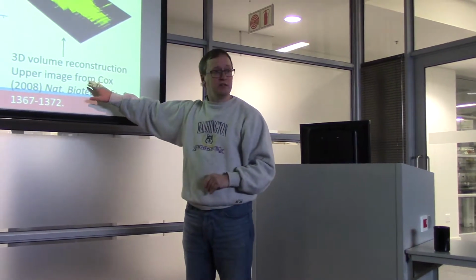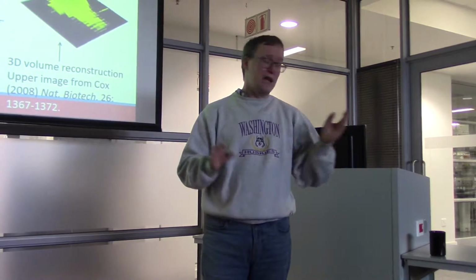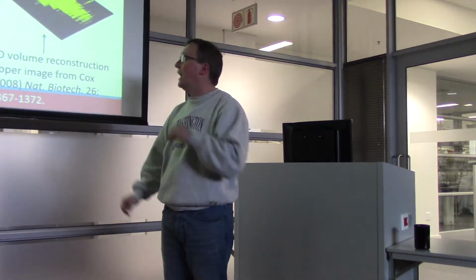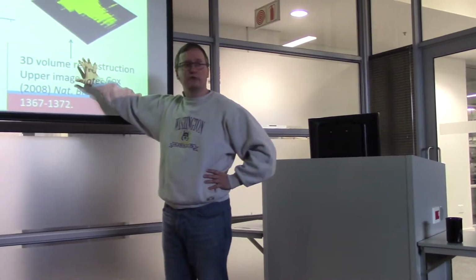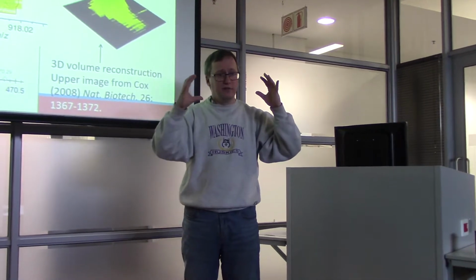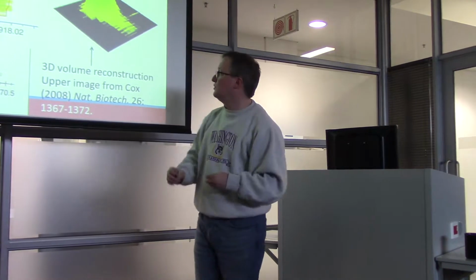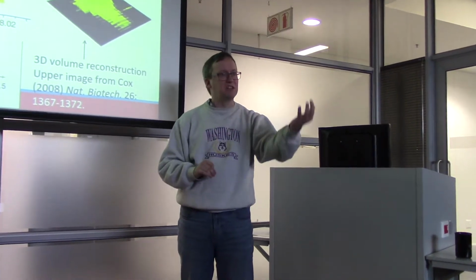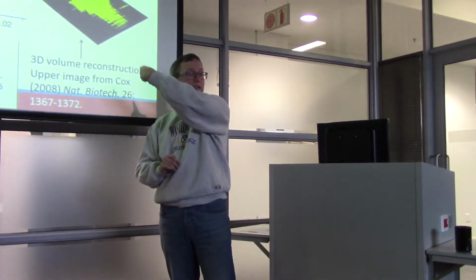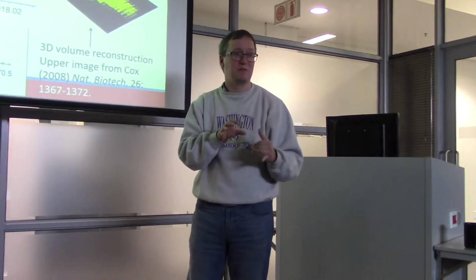So MaxQuant is one of the major tools used in South Africa and in Europe and at a lot of places in the United States for that matter. It came out of the Matthias Mann Lab. And this software is capable of using this 3D model of a particular feature in this chromatographic space to associate a particular peptide that's been identified from tandem mass spectrometry with an intensity that's been integrated in both m over z and retention time space.